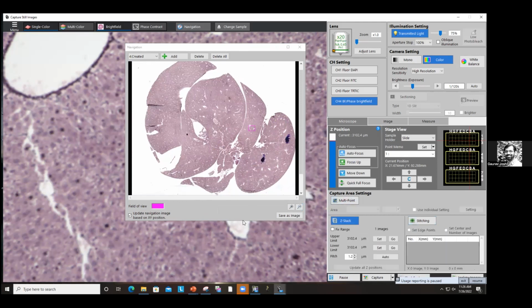I can turn on my Z stack, figure out my Z positions. So let's say, where am I right now?